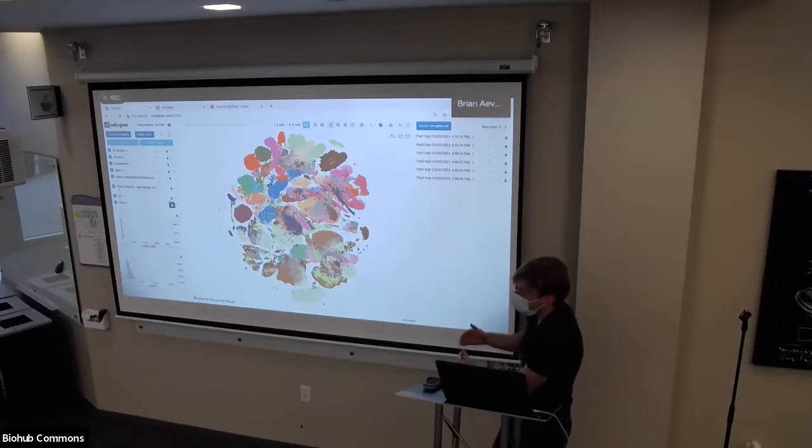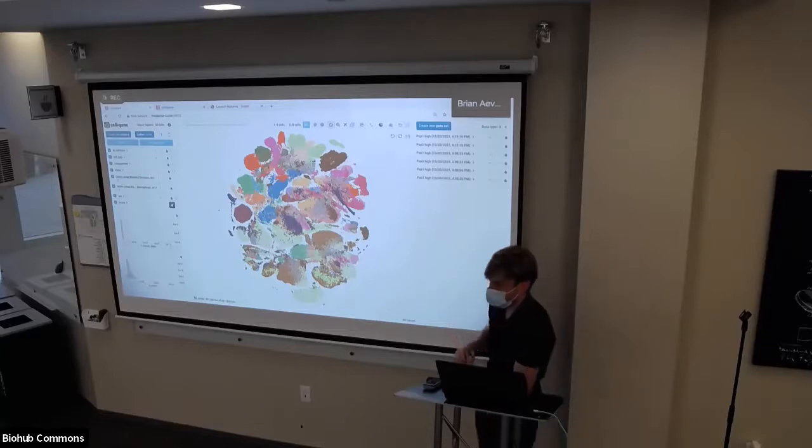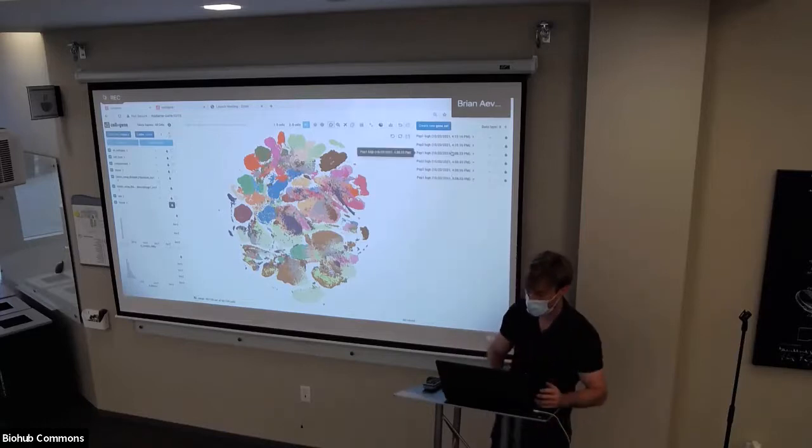Yeah, so we're already making progress towards the dream of making cell type marker gene identification easy, because we don't have to do one versus one. We just do one versus all using the hotkey super quickly. For sure, it'd be really useful to have a button you click and it'll just generate differential expression gene sets, for the sake of not cluttering this, only the ones that are highly expressed in the cell type of interest. For example, if I hit cell type, you click a button, it does it for all of them.